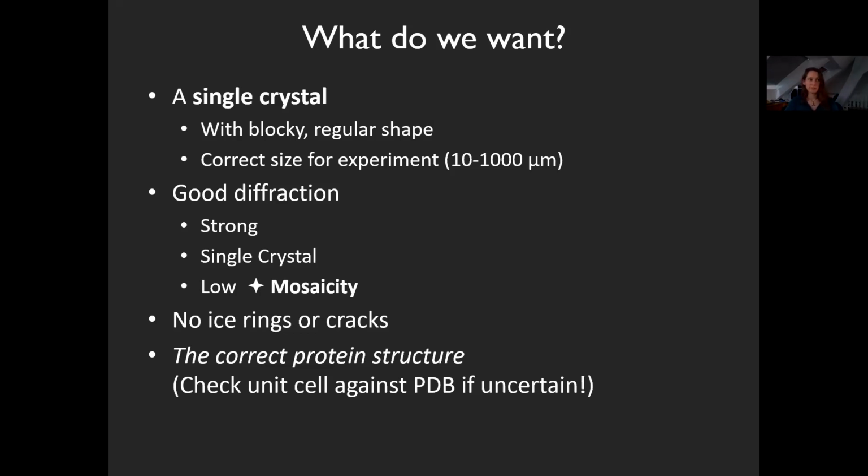And they write to me, "Dear Andrea, we have this crystal that we got after 4 years in the lab, and we can't phase it for the love of God, although we are sure that our heavy metal is in." And then you calculate it through and you find out that there would be 0.5 monomers of their sequence that would actually fit into the volume of the asymmetric unit.